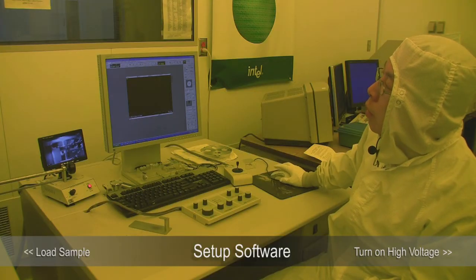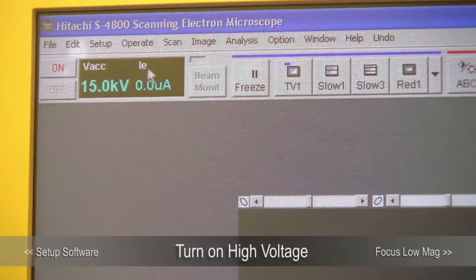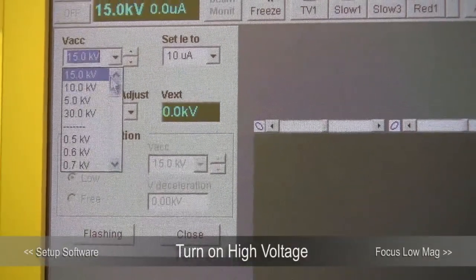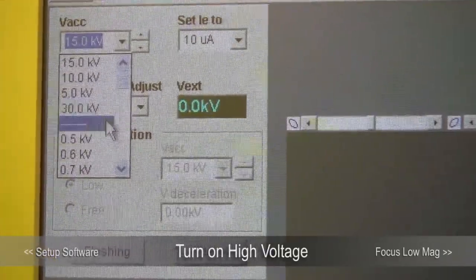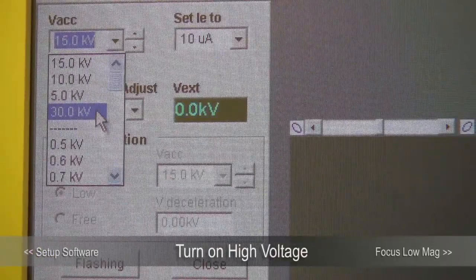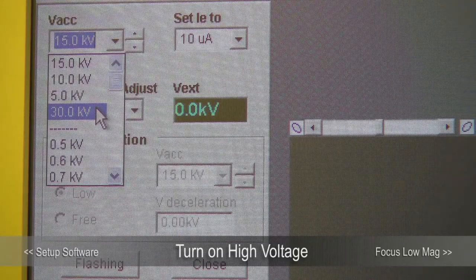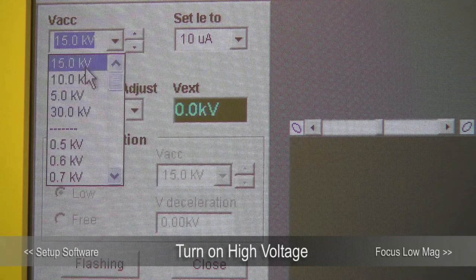Once it's at the home position, you can turn on the high voltage. To turn on the high voltage, click on this icon. The maximum high voltage is 30 kV and the lowest is 0.5 kV, but usually we only go down to 1 kV. High accelerating voltage gives you better signal-to-noise ratio because it has more electrons, but the scattering volume is higher so the resolution won't be as good. That's why most people choose between 15 and 10 kV. We are going to use 15 kV today.